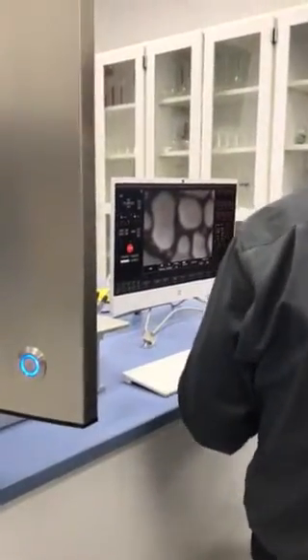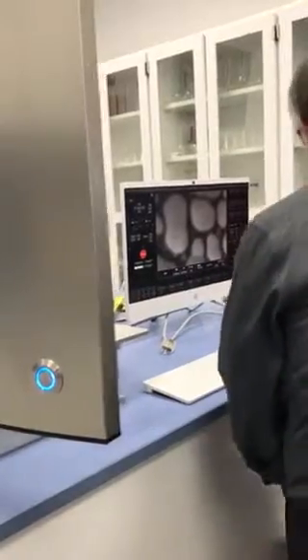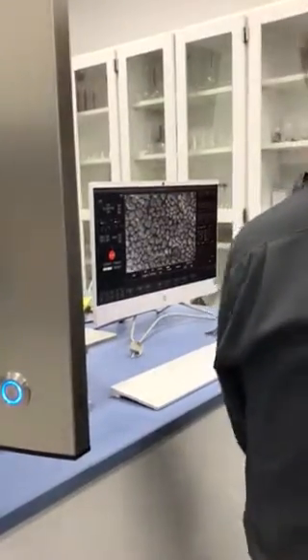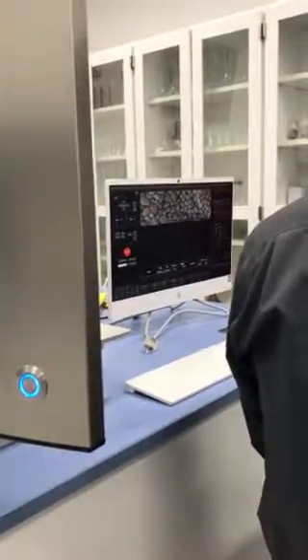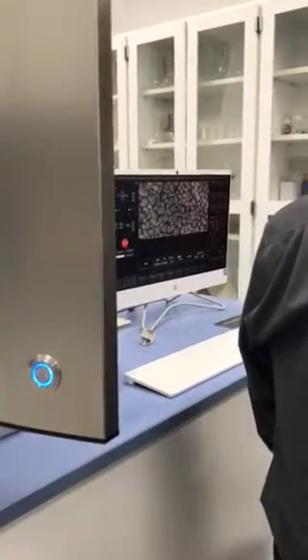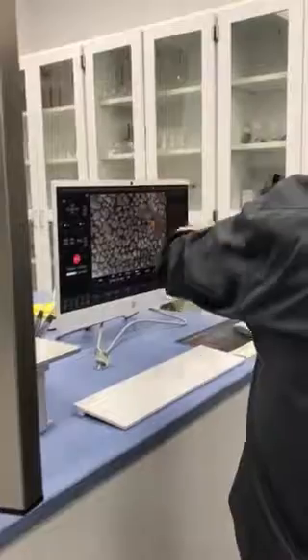Just scanning at 247,000x — Dan, where are you normally operating with your SEM? 20,000x. 20,000x is what we'll work at. Let's lower this down to even 40,000x, which is still a big deal, and the image just looks beautiful. I'm also developing a new aperture assembly with the SEM. Right now I've got the beam totally closed — the smallest spot size. There's so much signal that I can actually run this and see very nice contrast with the smallest spot size.